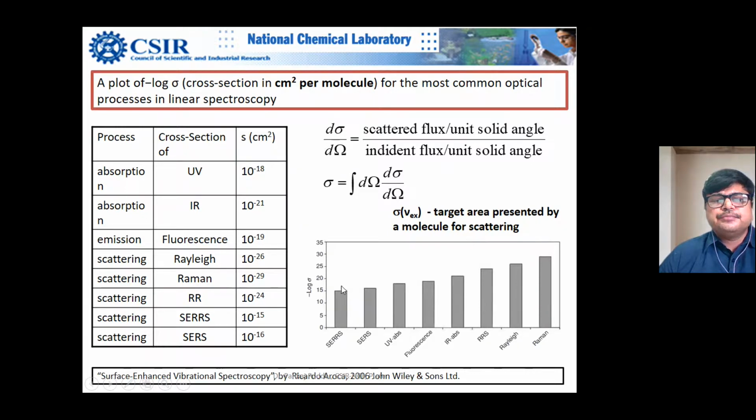You can see it here, and so this is quite high actually. This is quite high. And next comes SERS, which we routinely do in our lab. We publish a lot of papers using virology, and so we have done a lot of work on this, SARS-CoV-2, the spike protein of all these four variants, and then we were able to look at the genetic differences in different strains using this technique.